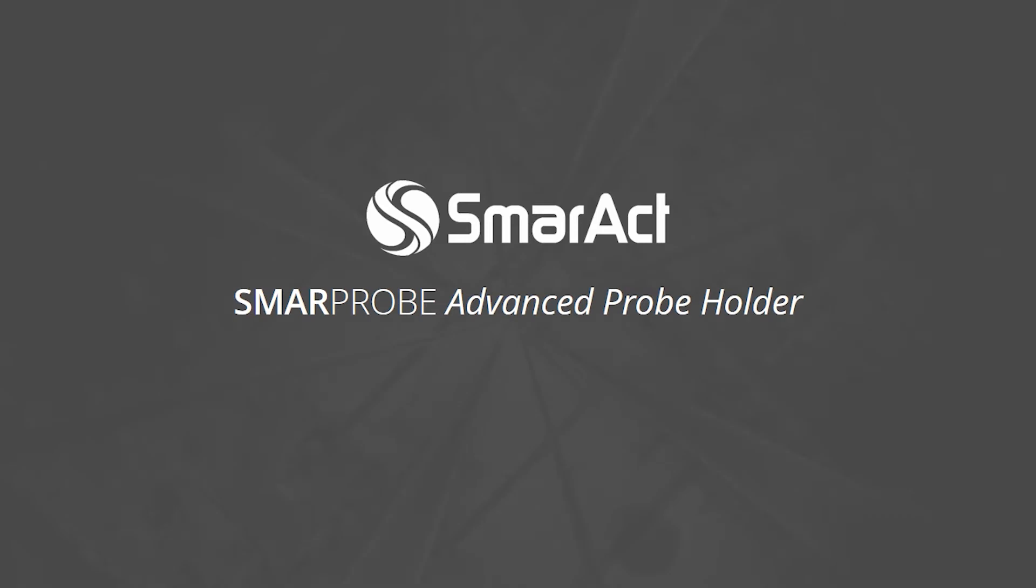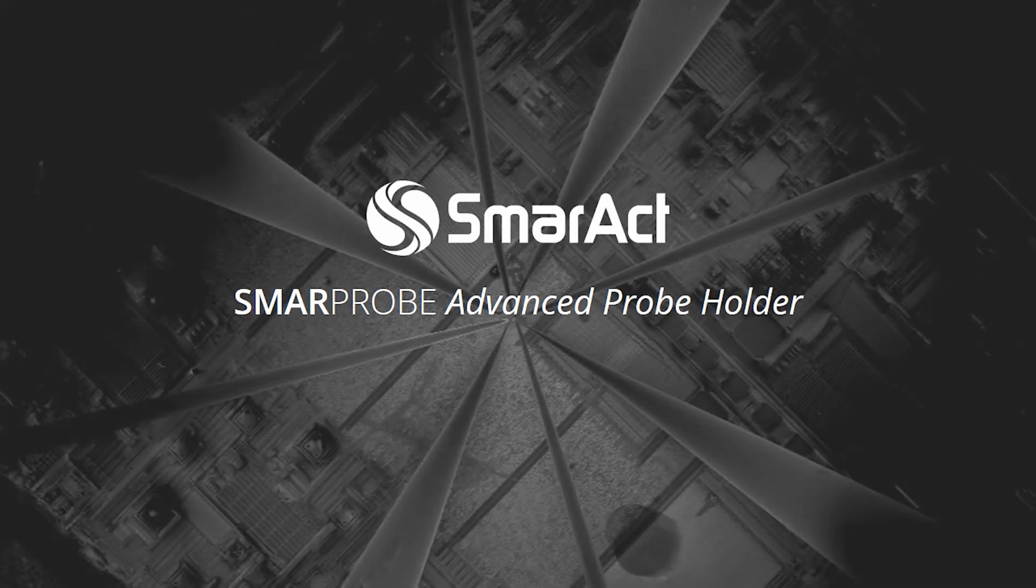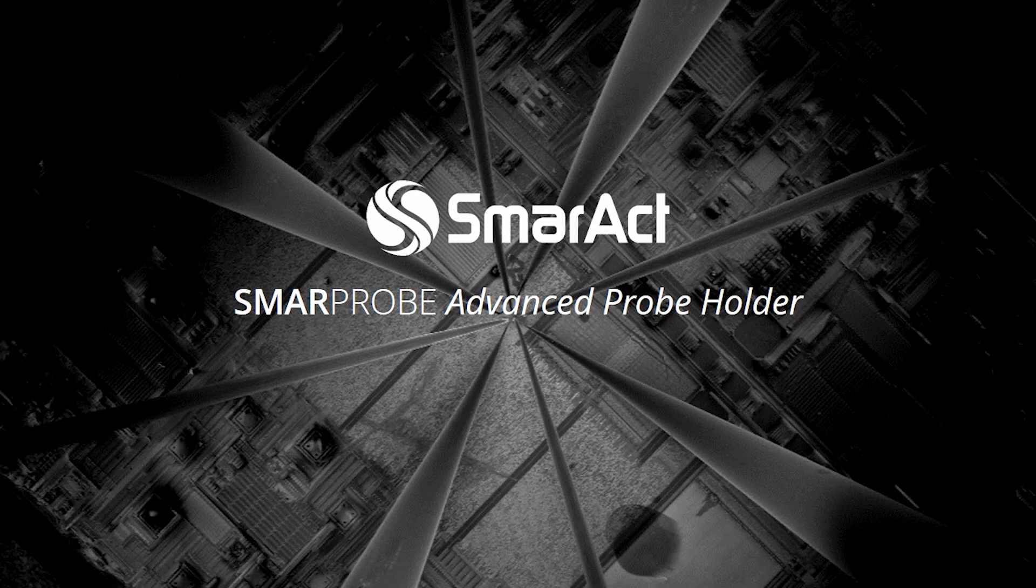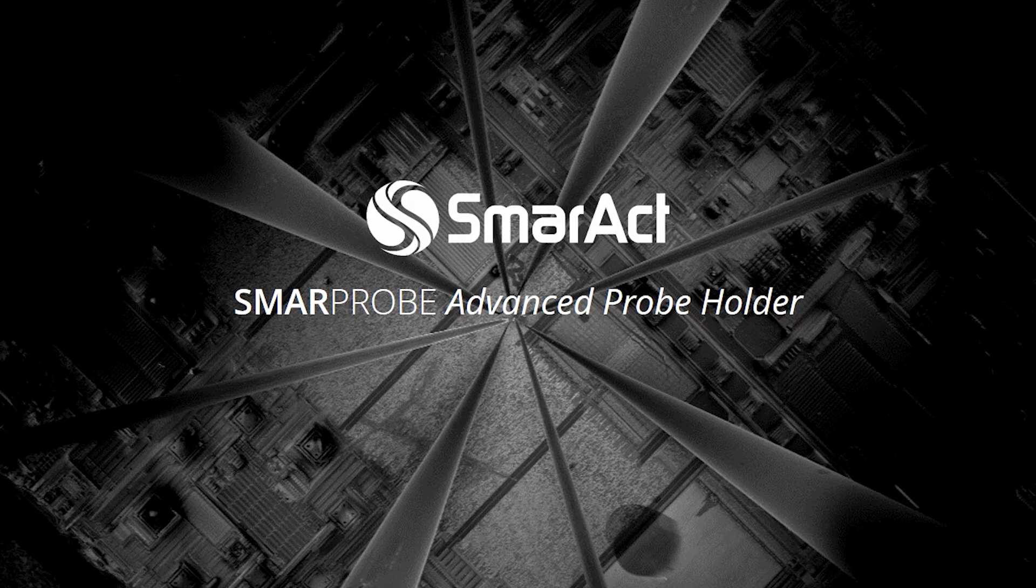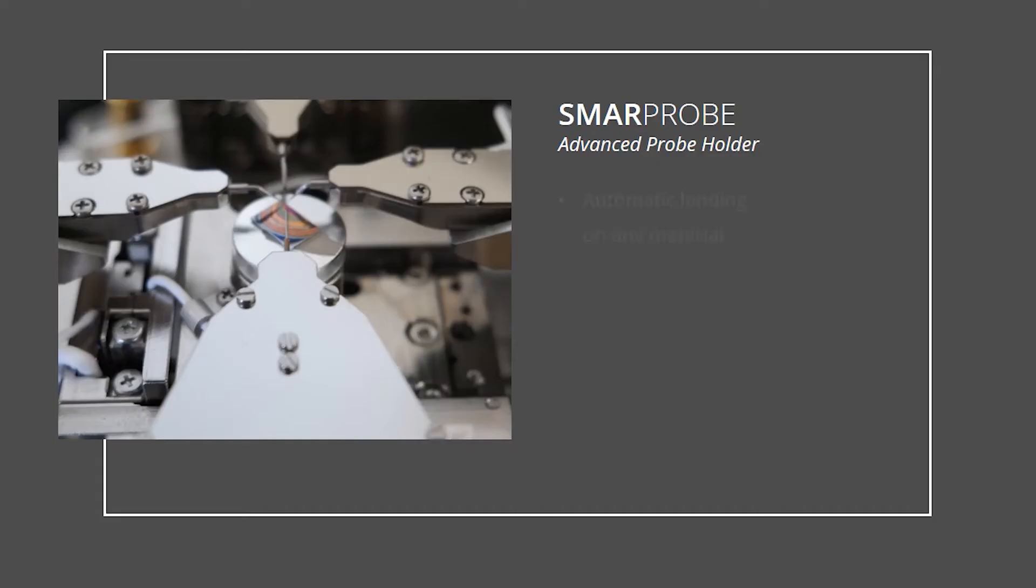To simplify the process of landing the probes onto the sample, the Advanced Probe Holder is available. It enables automatic landing on any material: soft, hard, conductive, or non-conductive.